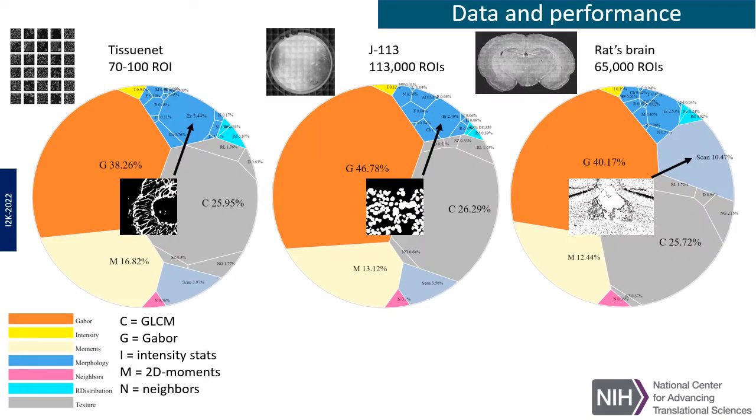Different datasets put different load on each zone of the Nyxus architecture. Processing an image having 70 to 100 relatively complex regions of interest results in increased morphology timing. We can see the increased erosions time share, for example.